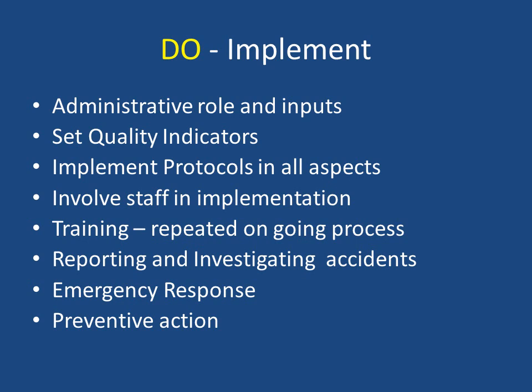Training at regular intervals and assessment of performance for all levels of staff. Reporting and root cause analysis of all accidents. Evaluate the emergency response and institute corrective action and preventive action.